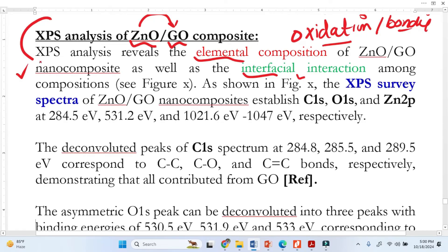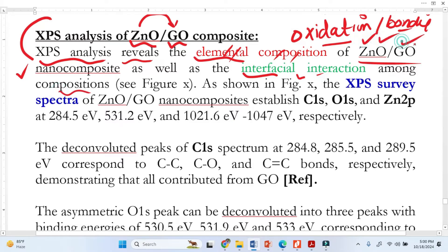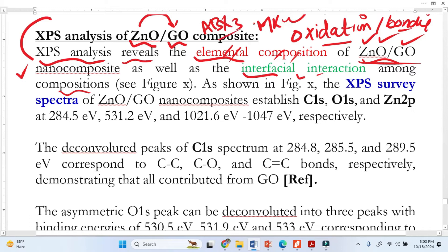Now let's see how to write this up. We write: 'The XPS analysis reveals the elemental composition of this nanocomposite as well as the interfacial interaction among the components' — meaning zinc, oxygen, and carbon. In your case this combination may be different; maybe you are doping, or discussing a perovskite ABX₃ structure, so it varies.